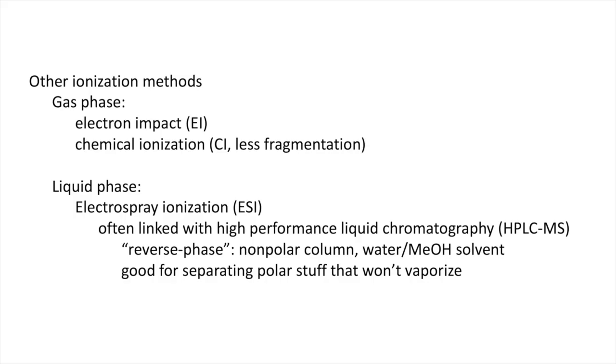Let's finish up by looking at a few mass spec methods, both ionization and detection, that are used besides gas chromatography mass spectrometry. LCMS and MALDI-TOF are really important in biochemistry, in protein, proteomics, stuff like that. So we're going to just briefly touch on these other uses of mass spectrometry.